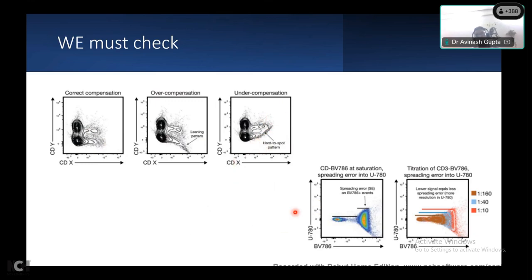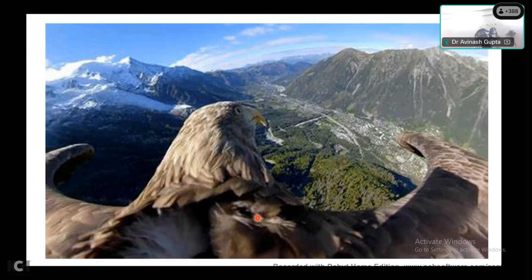Simultaneously, you should have knowledge about the spread of the population. Some cell populations with that particular channel will be spread. If you see this angle going like this, this is not proper positivity. This is just a spread. So before commenting on the positivity, you should be aware of the spread or spill error in your assay. And then you will have an eagle's eye view, like your scanner. You should view at least 4 plots like this before getting the population further.